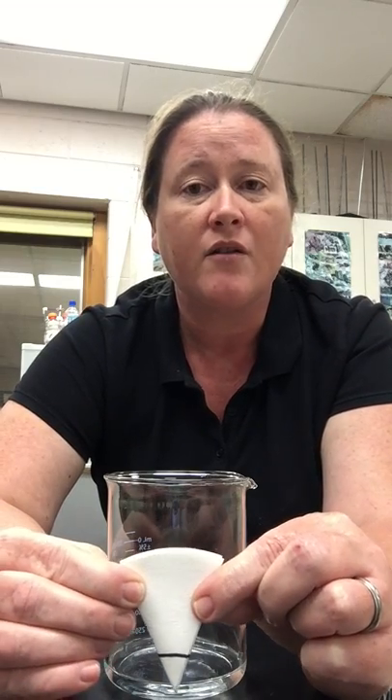Now different components in the ink have different affinities for water, or likeness. Some of the ink colors will like water more than others, and the ones that like the water the most will travel the farthest with the water. The ones that have more of an affinity for the paper rather than the water will stay behind and stick to the paper.